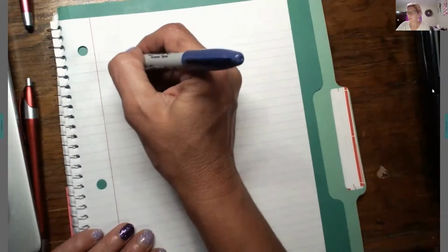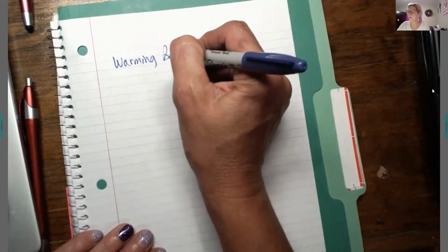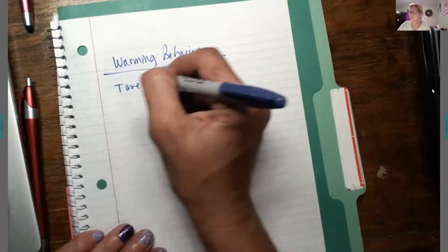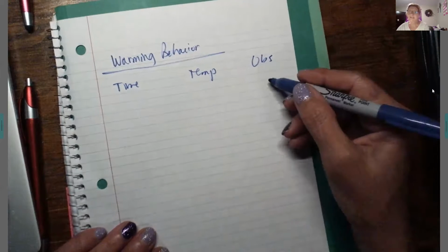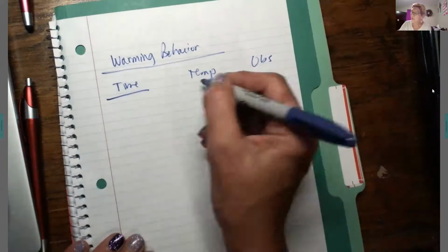So the next step is called warming behavior. And you're going to do the same thing. You're going to do time, you're going to do temperature, and you're going to write down a few observations. Most of the time they're going to be the same, so you don't have to write them every single time, but when you start seeing a change, definitely write that change.